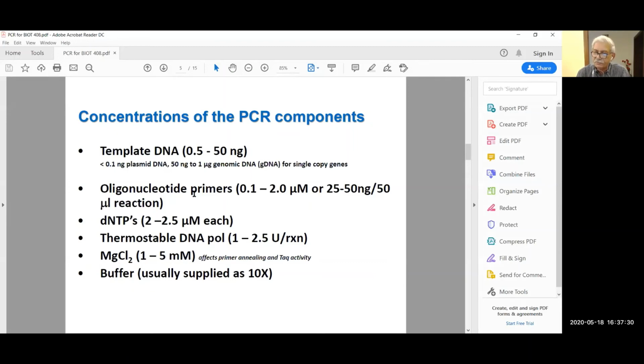So what will you do? What I do in my lab is, if I get 146 microgram in a tube, I add 146 microliter of water to dissolve it. High quality water, obviously. In molecular biology, whenever we talk about water, it is high quality water, which is sterile as well.